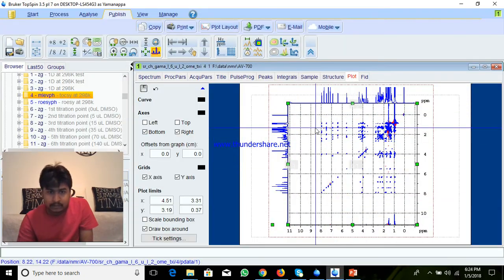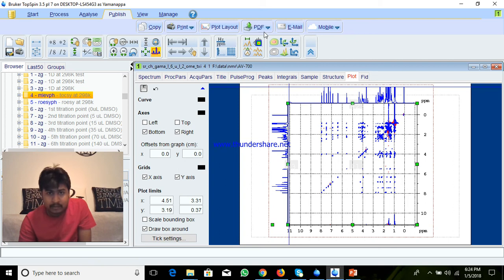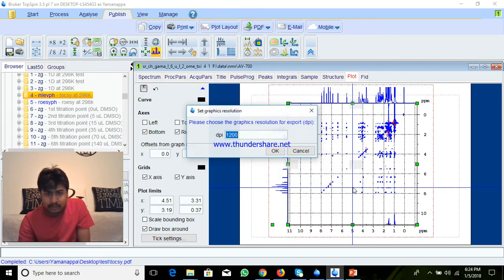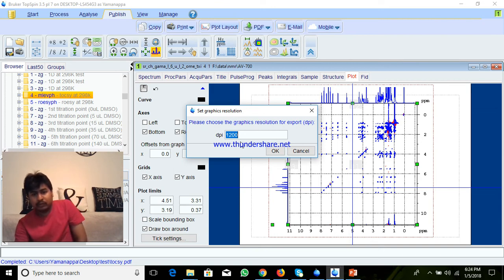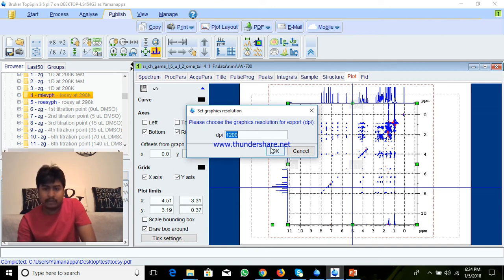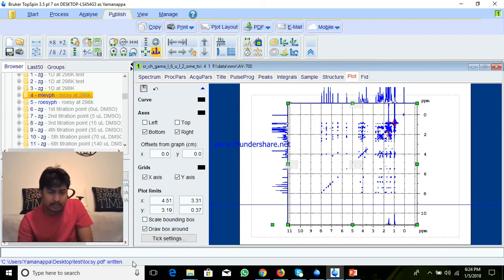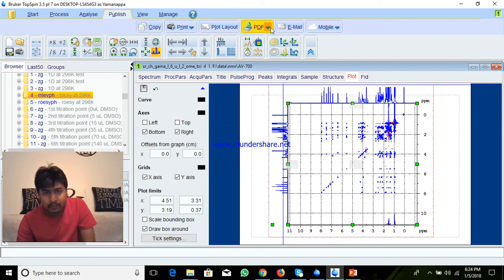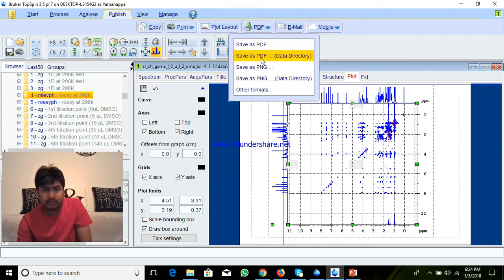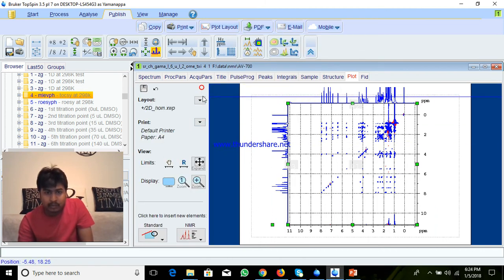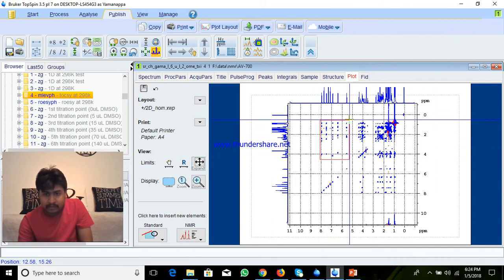If you want to save this as an image, you can Save As Image, or you can mail it directly by sending via email. If you want to expand, just right-click here — Expand — or you can vary the Plot Limits. So you can save this as PDF. I will save this as PDF.